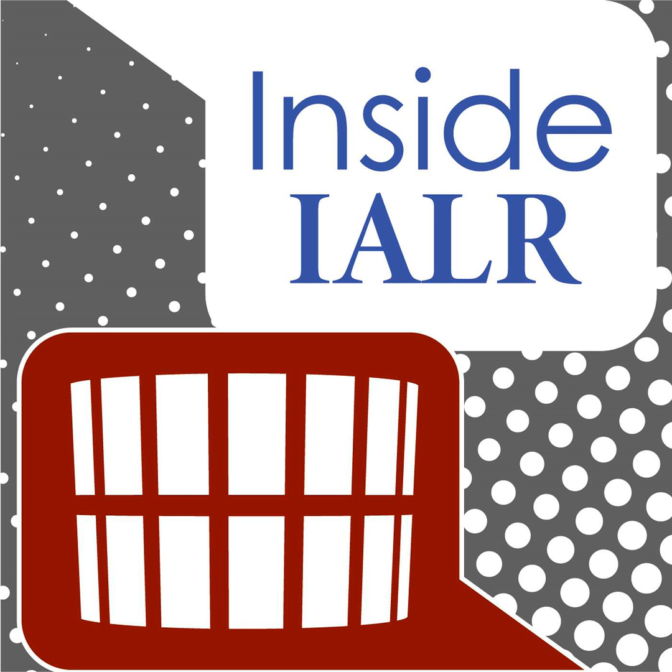Now, what's important about that is if you were just weighing it at the end, you would think nothing happened. But with all this data, we can see that something did happen, and we need to go back and focus on that component of it. So you get data that before was missed.